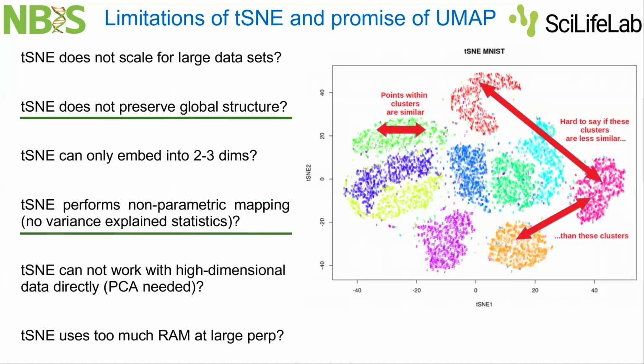So next, t-SNE was at some point criticized in the literature. There are a few limitations of t-SNE. People noticed that it's computationally very hard for large data sets. And then there was the obstacle that t-SNE, as I said, can look only locally. It can preserve distances between nearest neighbors, and this sets a limitation for your interpretation of clusters.